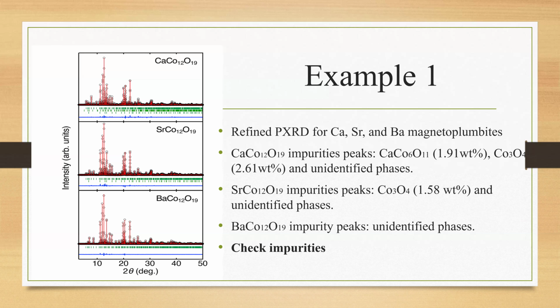Identifying even a small amount of impurity is crucial to understanding the material's properties, especially for magnetic or electronic applications.